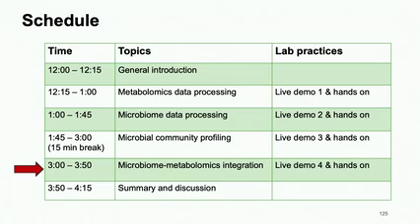So this is something that becomes more important when we go to multi-omics. Sometimes multi-omics is really strong and tells you a story. Sometimes it's very subtle, and some people can really, from these patterns, come up with a good explanation, but a lot of times it's tricky, especially for us. If we are not a domain expert, we are very cautious about seeing anything, but we try to give you a different perspective of the same data.